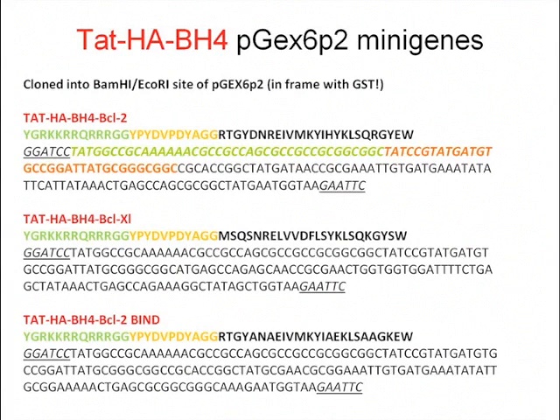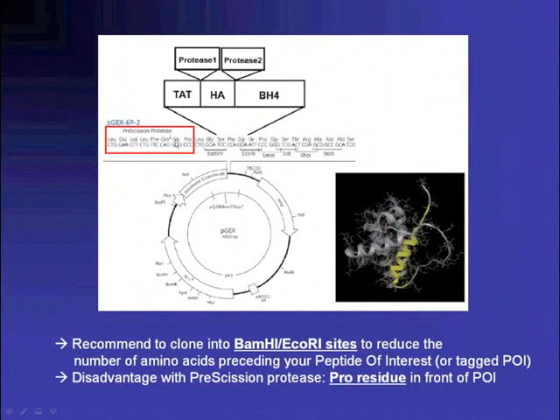However, we have tested the TAT-BH4 BCL2, which was active. But there I want to raise the concern that one needs to take into account that we have this glycine, proline, leucine, and I think also some glycine-serine, so that might be the difference.